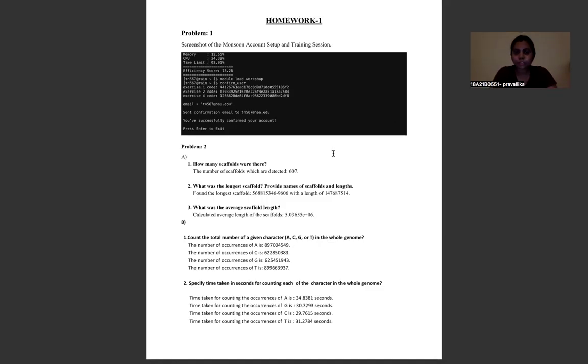Hello everyone, I'm Pravlika. In this video, I'm going to explain my analysis on human genome data. Here, the first screenshot shows my successful completion of the monsoon workshop.